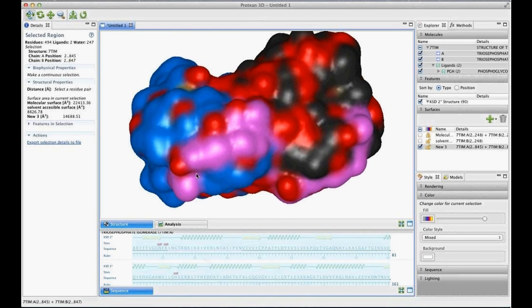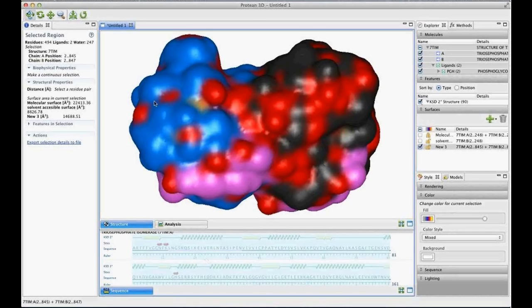This tells me that the pink region would potentially be an excellent antigenic region for creating an antibody for a native protein, whereas the beta strand region would be potentially more useful for a denatured protein and for using in other methods such as Western blots.